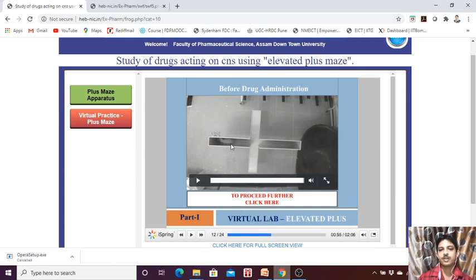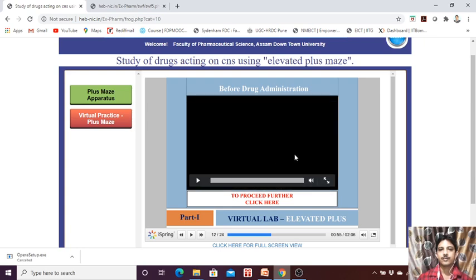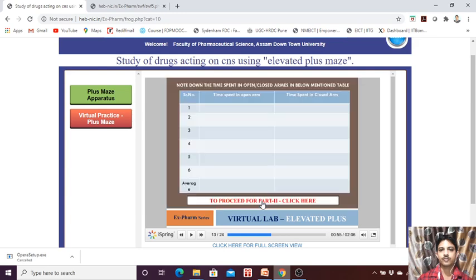The animal is now entering the closed arm. We record the total time spent in the closed arm, total time spent in the open arm, and the number of entries — number of entries in the open arm and in the closed arm. Both are required to note before drug administration.